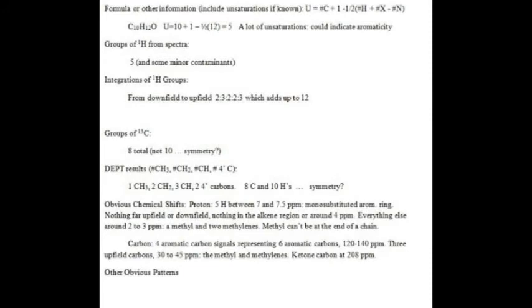The next section refers to obvious coupling patterns, which is yet another terrific source of information. We have not covered those yet. Oh, we're going to. Oh, are we going to? But one step at a time. So we're going to skip that one for now.